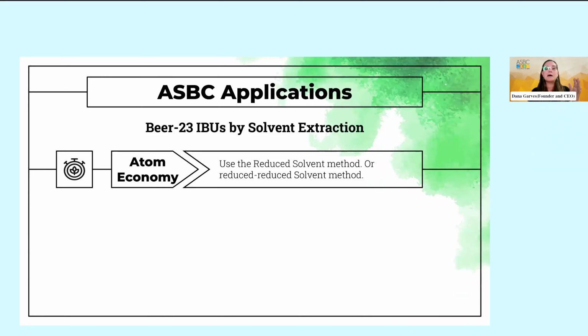And so what I use is 5 milliliters of isooctane to 2.5 milliliters of beer, and then 250 microliters of hydrochloric acid. And what that does is means that a cuvette holds roughly 3 to 4 milliliters. So I use almost all of my isooctane extraction liquid for that final measurement with almost none left over. So I'm minimizing that byproduct of extra isooctane.